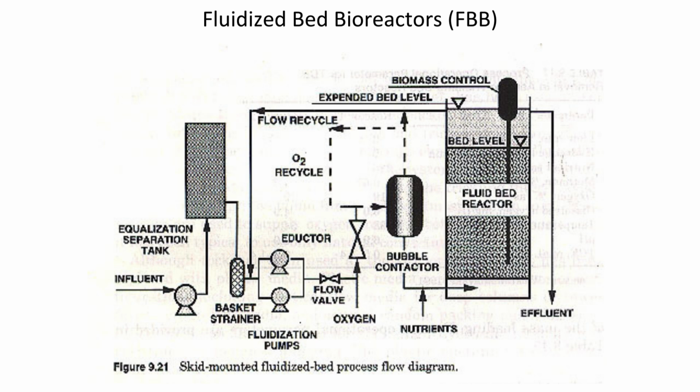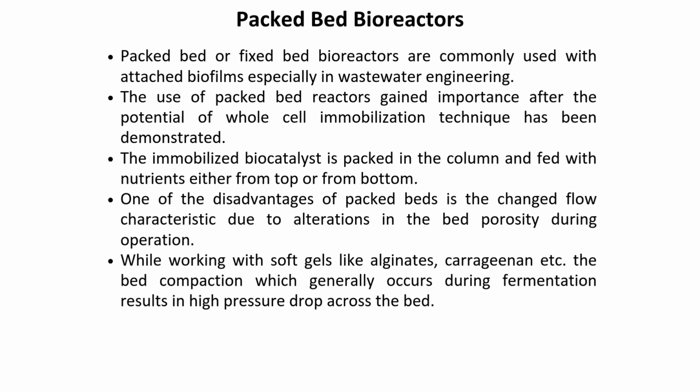Now let's look at packed bed bioreactors. These are also called fixed bed bioreactors and are commonly used with attached biofilms, especially in wastewater engineering. Their use became more important after the potential of whole cell immobilization techniques was demonstrated. In these reactors, the immobilized biocatalyst is packed into a column, and nutrients are fed through from either the top or the bottom.